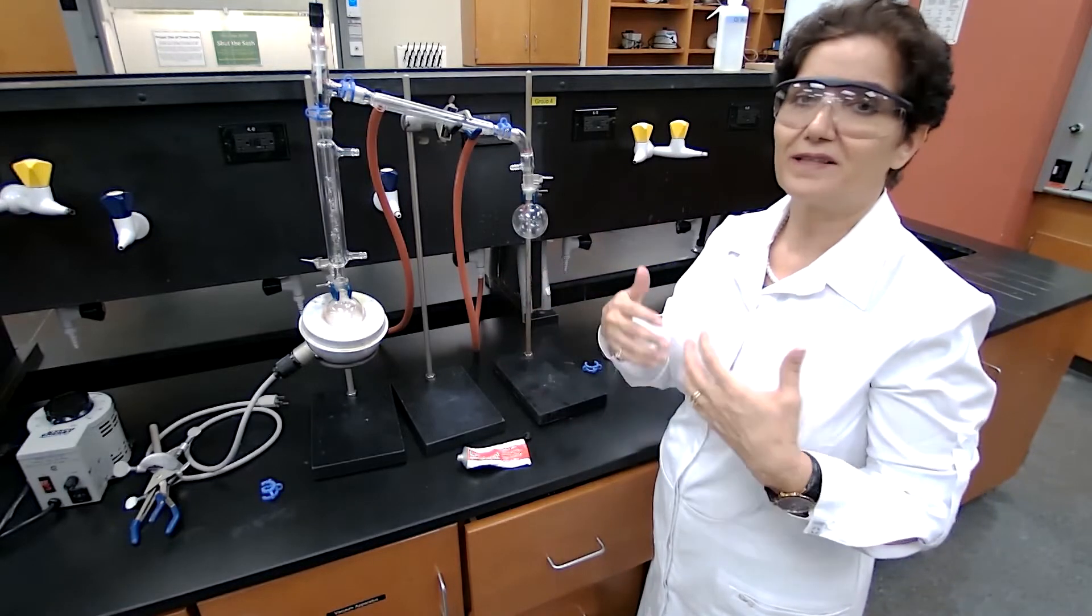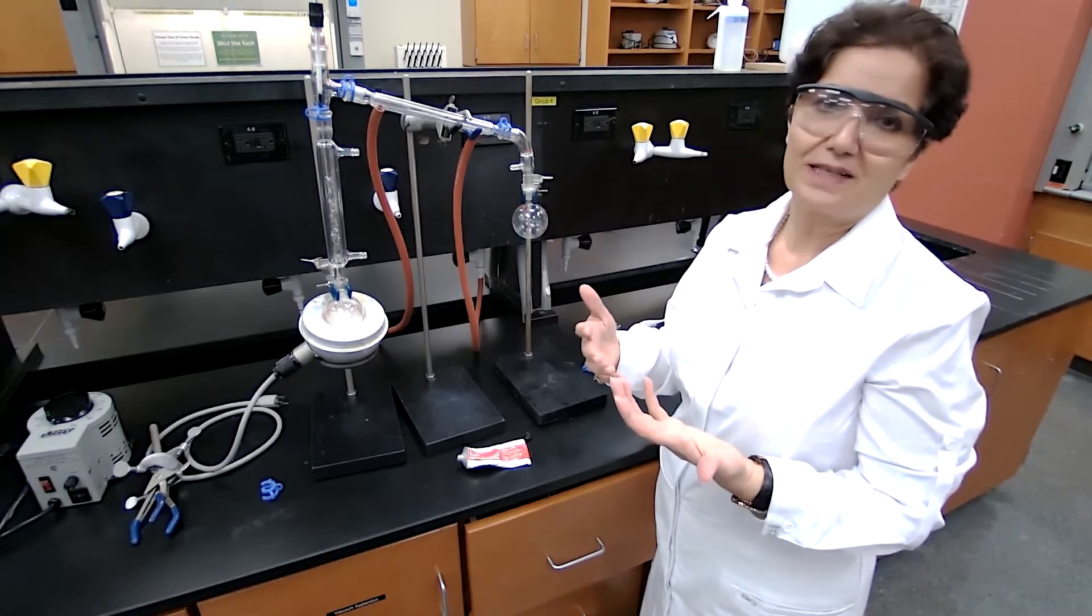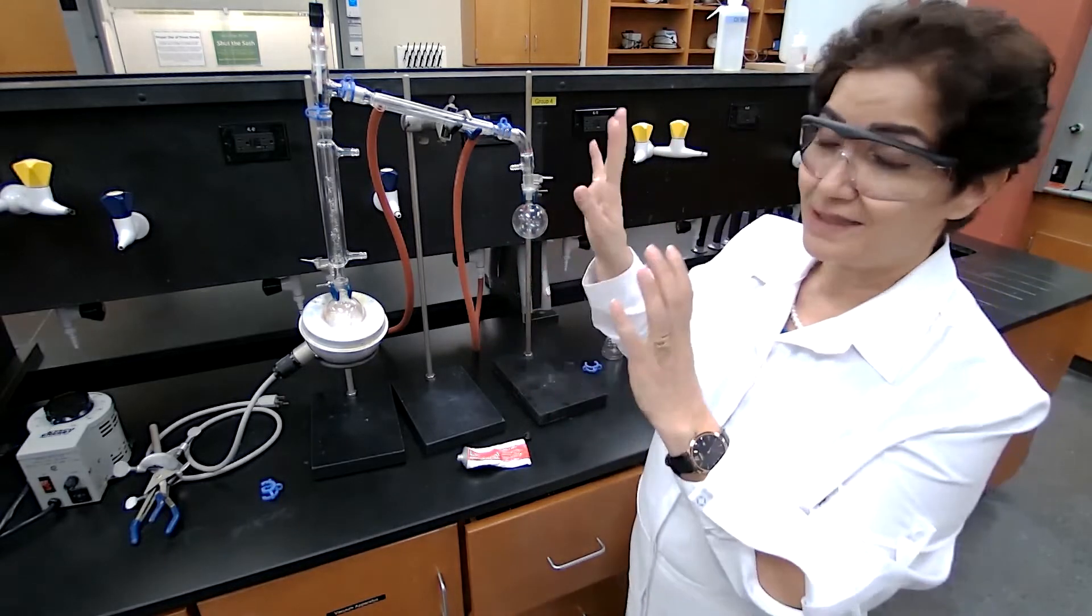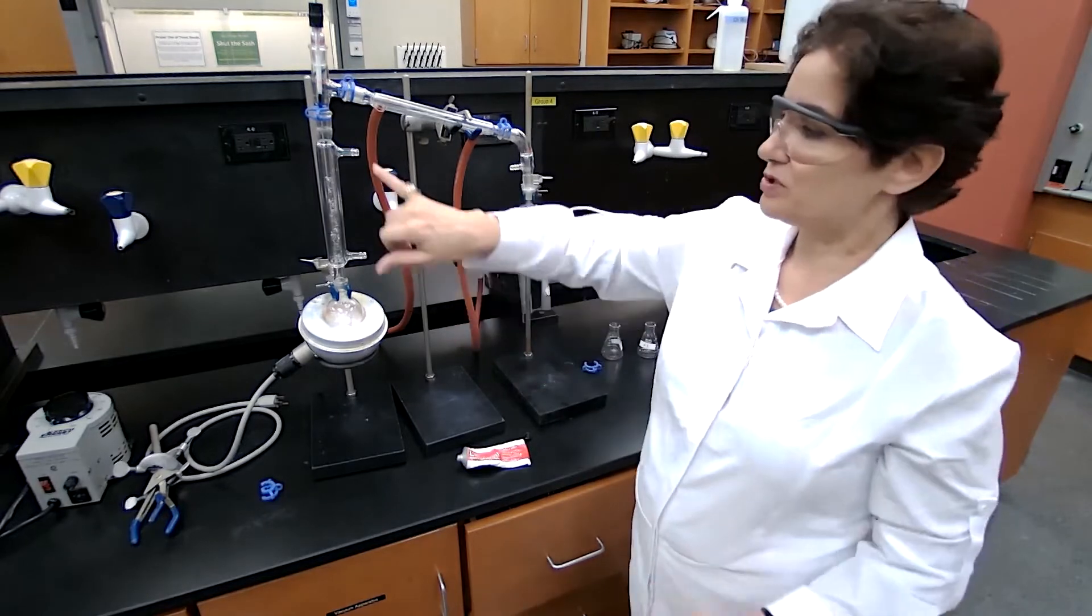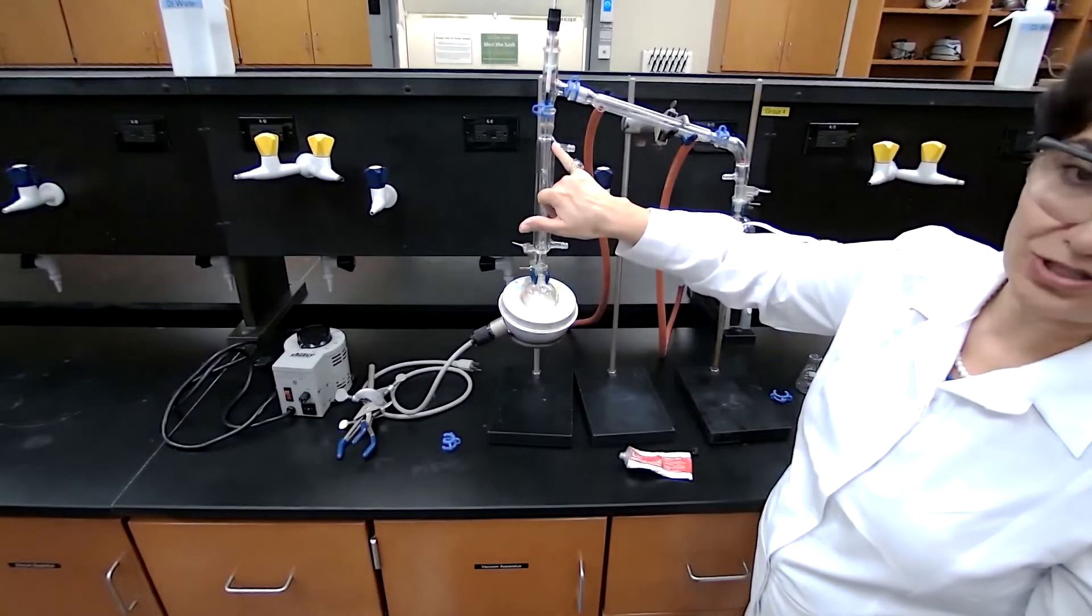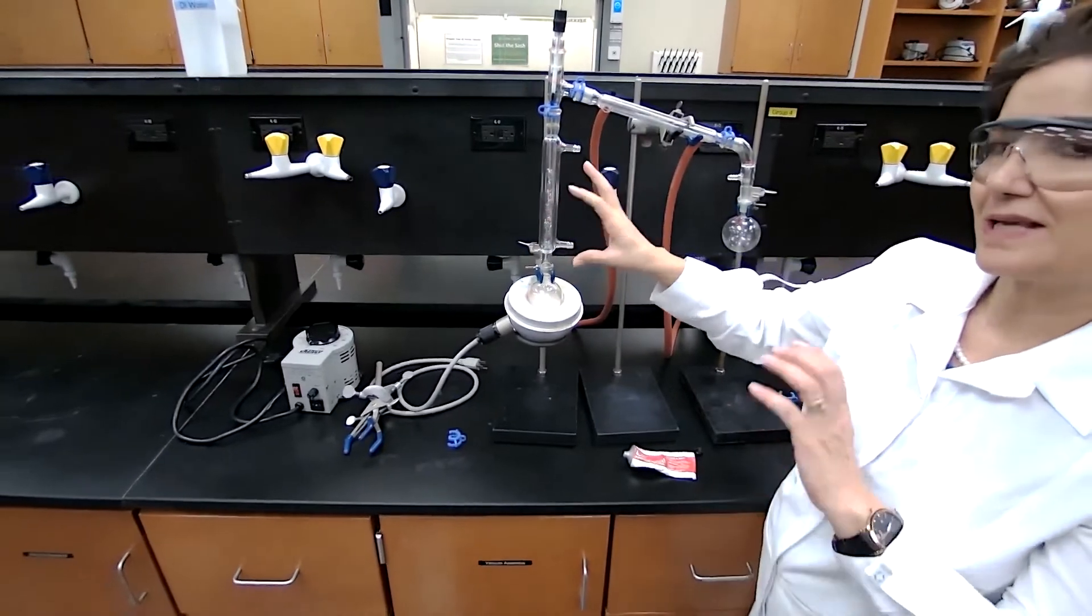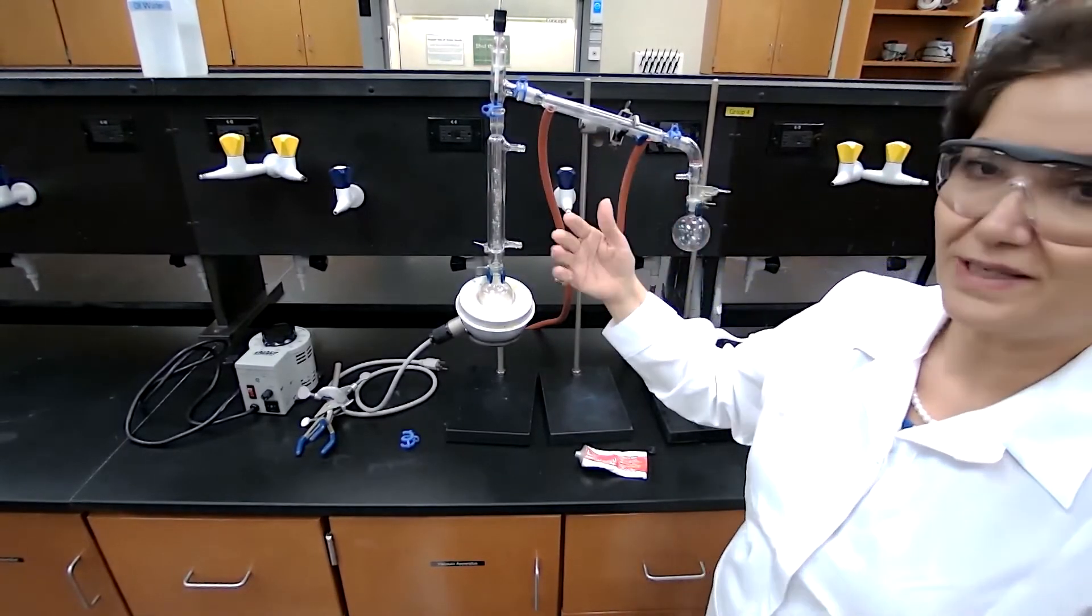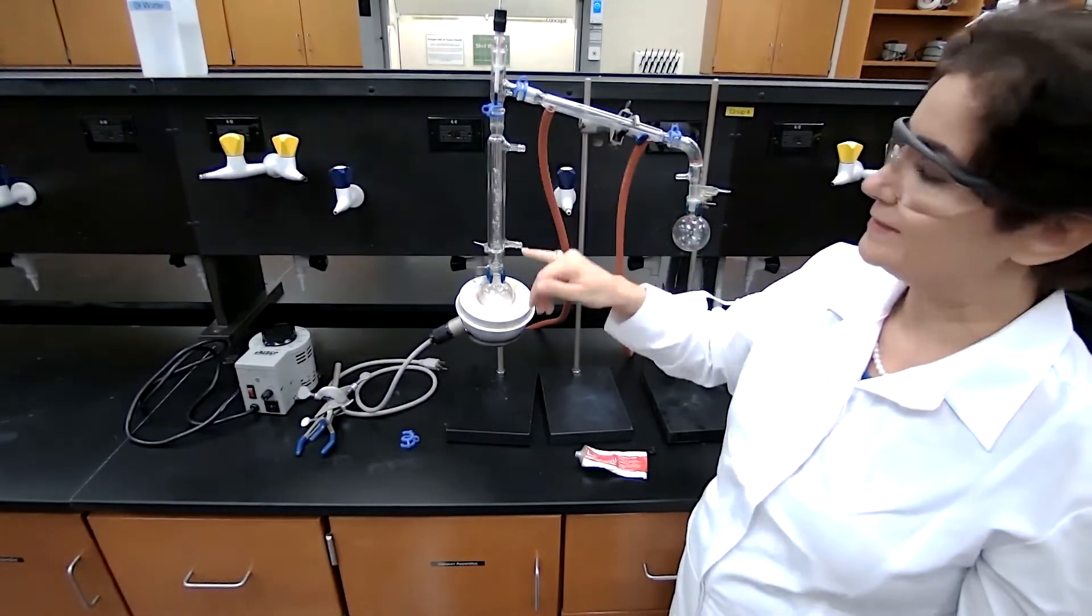I also talked about the theory of distillation. I'm going to just add one thing about the theory of fractional distillation - how does it enable us to separate components of the mixture with 20 degree difference in boiling point?